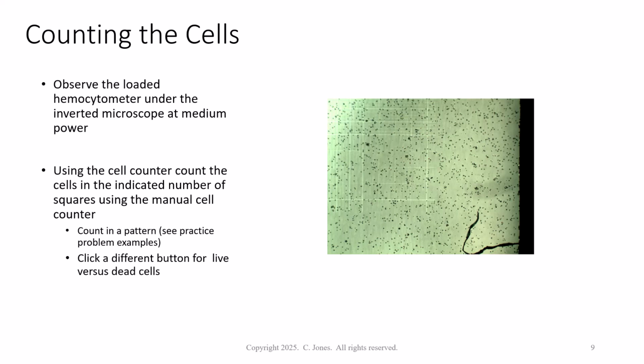again, this is a cellometer. We're looking at this hemocytometer. Actually, this is a real hemocytometer. We're looking at this hemocytometer under low power. We'd like to get it at a slightly higher power, but it illustrates several things here. So first of all, this is our counting square, right? So in real life, with not so good illumination, this isn't a very sharp picture. You can see it's harder to see the lines clearly, and the magnification is too low. We would want to go up to the next level of magnification. But that's our counting grid. So all of these cells outside the counting grid, we don't count these. These are completely excluded. Okay?